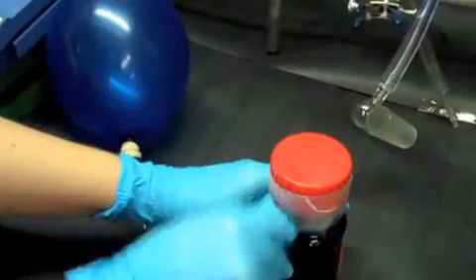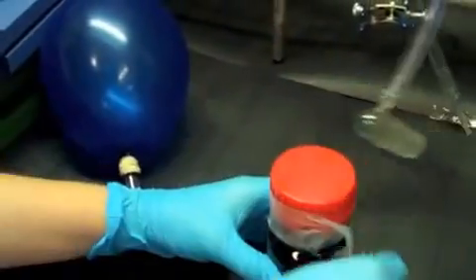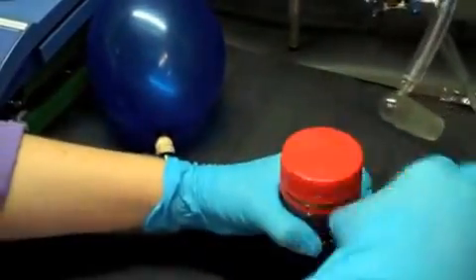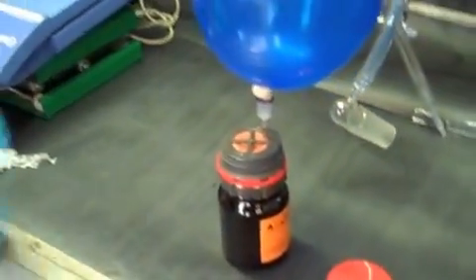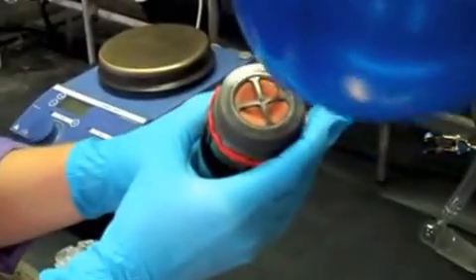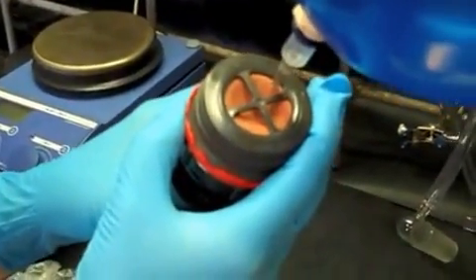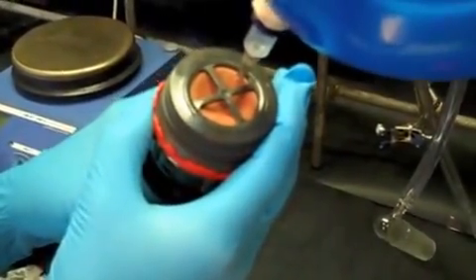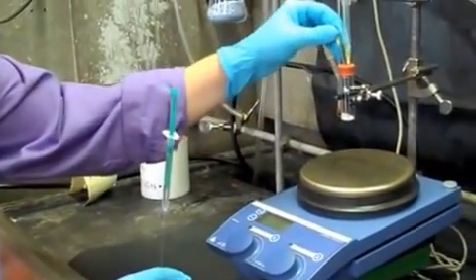Note that the n-butyllithium bottle is parafilmed. We'll remove the parafilm, open the bottle and quickly insert our needle, placing the bottle under argon. Note that this bottle has a SureSeal. It is imperative that you only use the smallest gauge needles in the lab, which are the black needles, when using a SureSeal bottle.